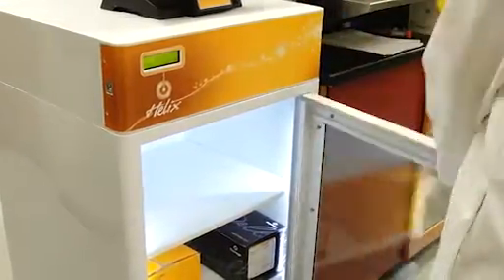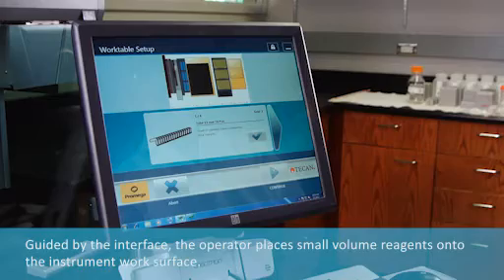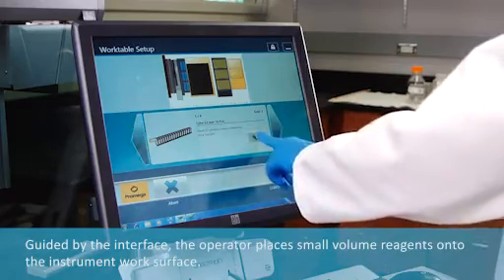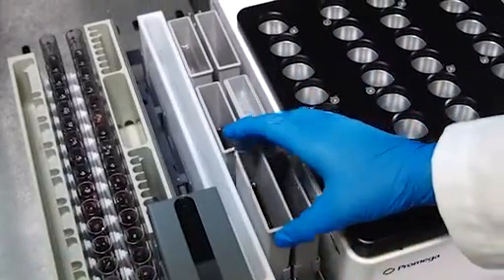Guided by the interface, the operator places small-volume reagents onto the instrument work surface. Reagent lot numbers can be scanned.